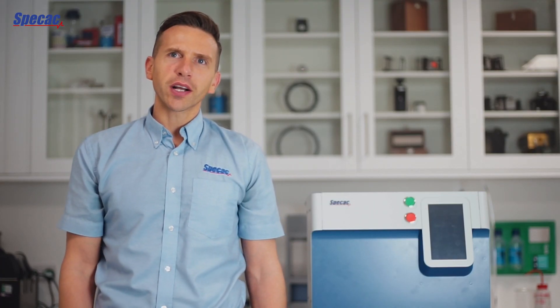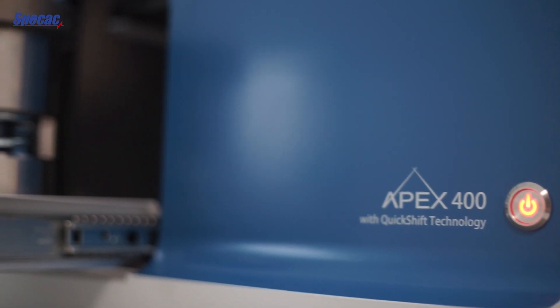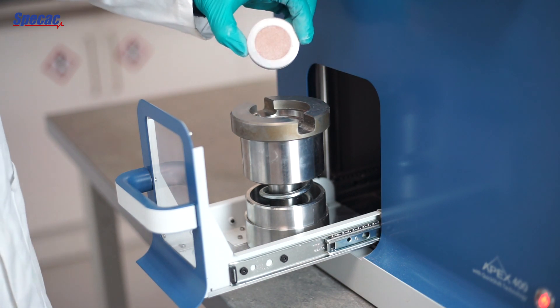We have learned a lot from our customers about what makes a great hydraulic press for laboratory scale pellet preparation for XRF, XRD, OES and elemental analysis. The APEX 400 is packed with features that help simplify the technician's workflow, removing or simplifying steps from the process.